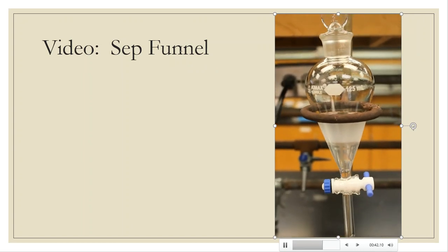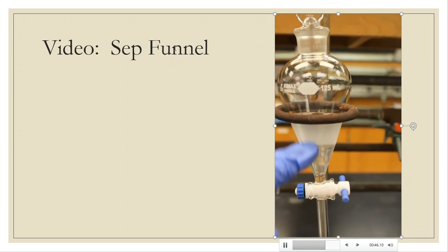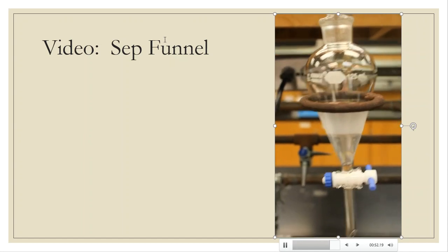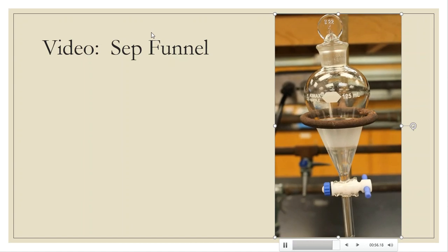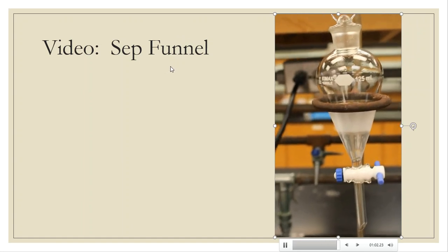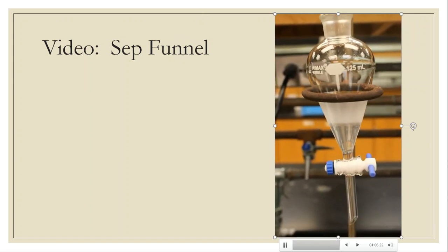So there's the separatory funnel setup. The problem here is that people are not patient. They do not allow these layers enough time to separate from each other before they go on to the next. So because I'm doing it, I'm going to wait another 10 minutes and just let it kind of hang out, and I'm not going to rush it because as a lab group together, we want good data, don't we? So that's what I'm going to do with the separatory funnel.